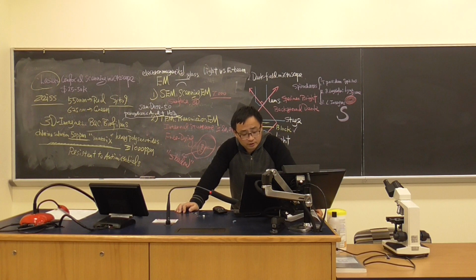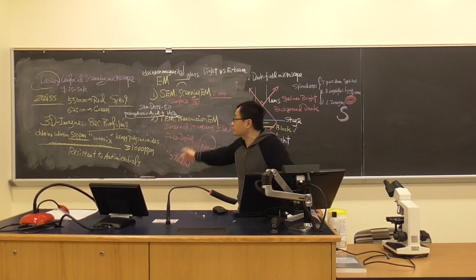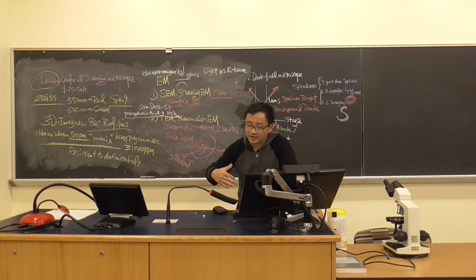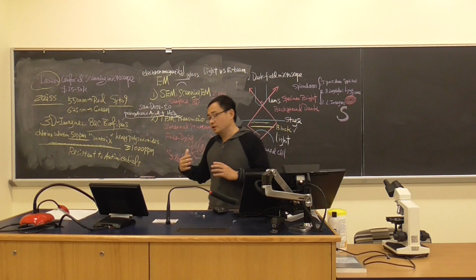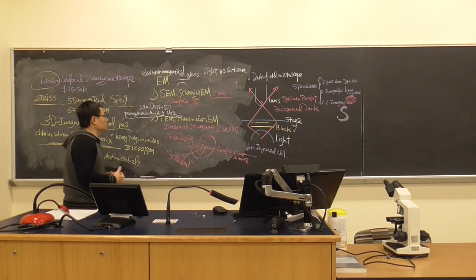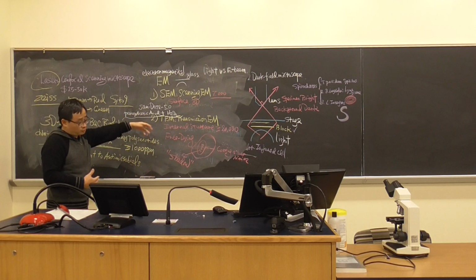The pathogen is always in the outbreaks of fresh produce, especially cantaloupes. So we did this using Listeria monocytogenes, which is also a gram-positive bacterial cell, and we can see the cell after treatment with peroxyacetic acid. We can see the width of the cell is changed, the height is changed, the roughness is changed. And this change is more significant with the increasing amount of the peroxyacetic acid and hydrogen peroxide used.